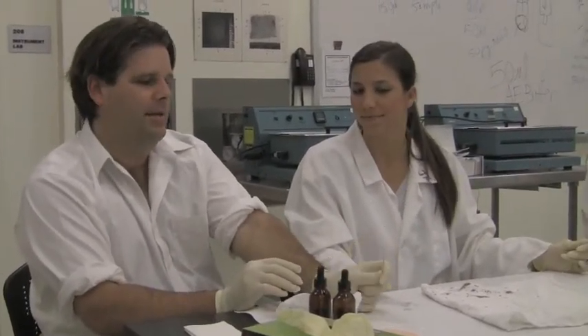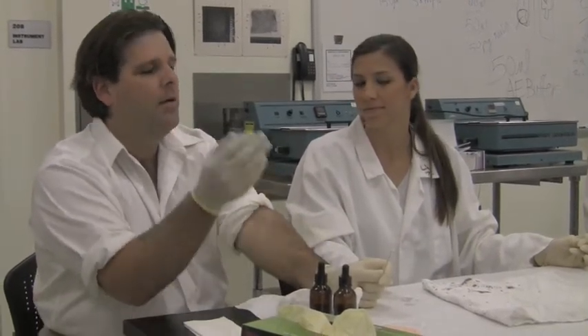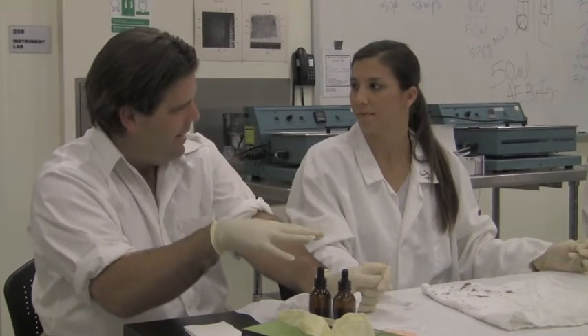There are confirmatory tests for blood, though they aren't used as often anymore — this would most likely go straight on to DNA analysis. So we've tested this positive. This is a presumptive test. We've got a color change, so we've got blood. We'd probably send this on to DNA at this point.